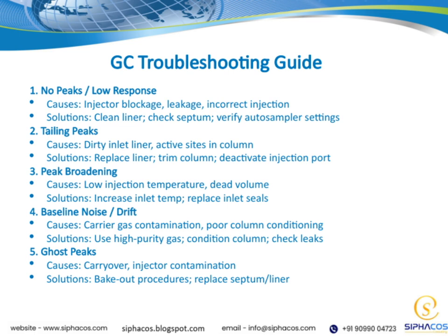Finally, ghost peaks are caused by carryover or contamination within the injector. To resolve these, perform bake-out procedures to clean the system and replace the septum or liner if they are contaminated. Eliminating ghost peaks is essential for accurate, reproducible results. By understanding these common issues and their solutions, we can maintain optimal chromatographic performance and trust the data we generate.